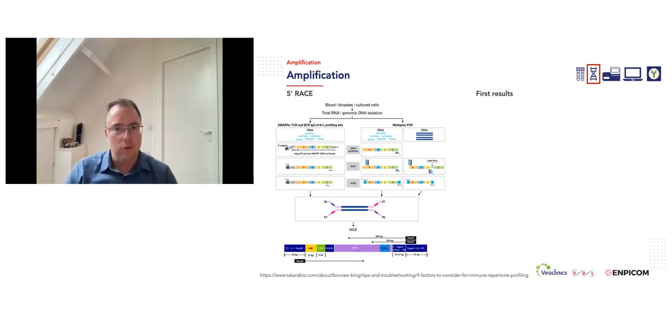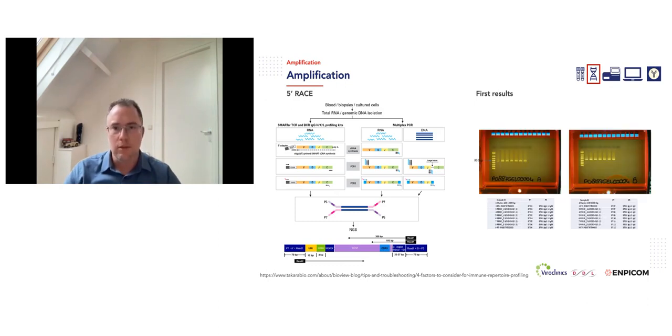Well, we tried to apply this, and our first results look quite good. We're obtaining bands of the correct size, things like that. The results all in all look very promising.